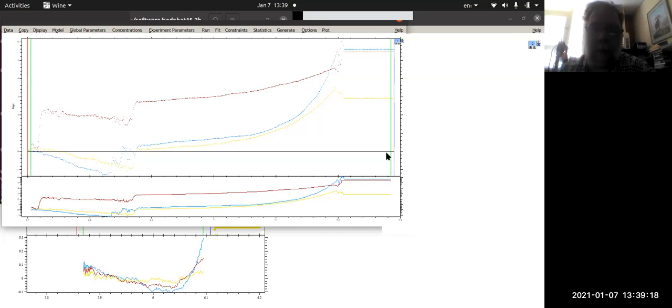And please reach out if you have any questions or if you want to talk about setting up an experiment, or even better, if you have data you've been struggling with and you want to throw your computer across the room because sedphat crashes on you twice a day. And as you saw, it crashed on me 3 times in about 35 minutes.